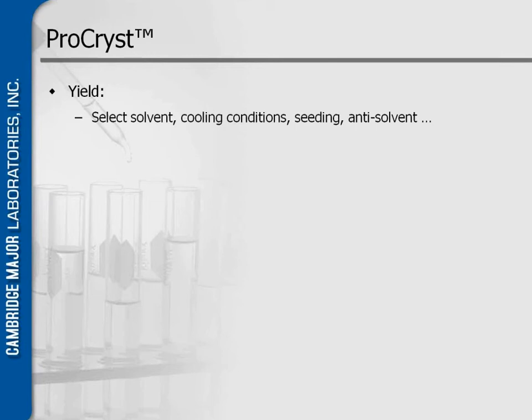Seeding can be important. Sometimes you just get a little bit of hazy solution and it doesn't really want to crystallize. You go down far below zero and finally it crashes out and you have a poor quality material. If you seed, you can control it better. Control means that you can get a good material out. Maybe an anti-solvent needs to be added. If a lot of material still remains in your solvent in solution, then anti-solvent may help you there.